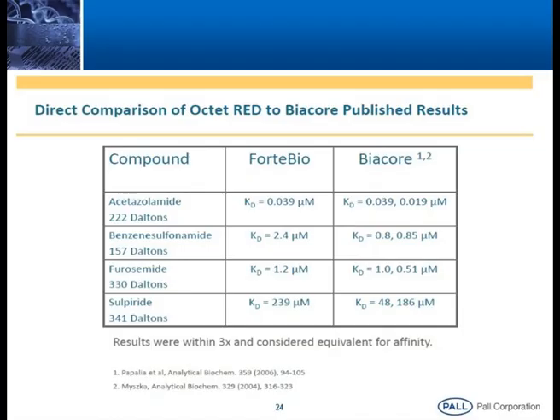This is a small molecule example. These are carbonic anhydrase inhibitors. Carbonic anhydrase was immobilized onto a sensor, and then these drug inhibitors were passed over it. These results are on par. This is also once again a publication by Myszka.